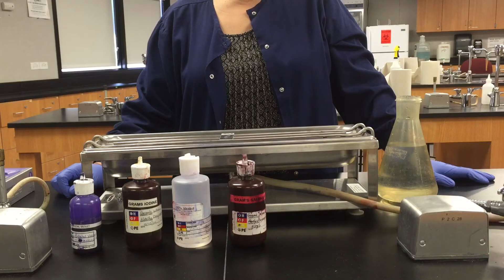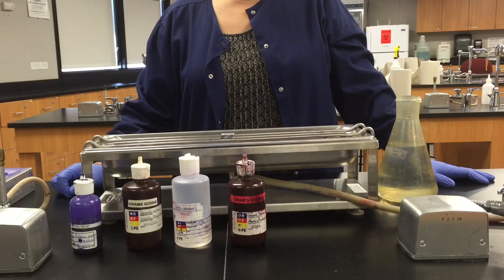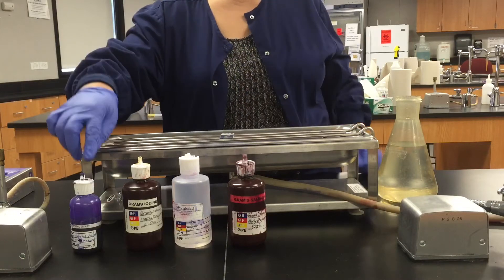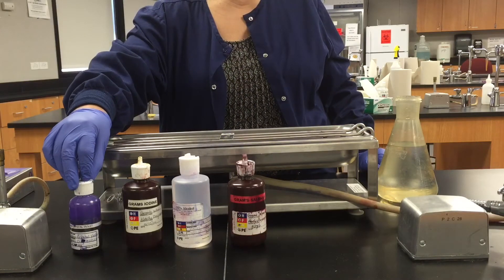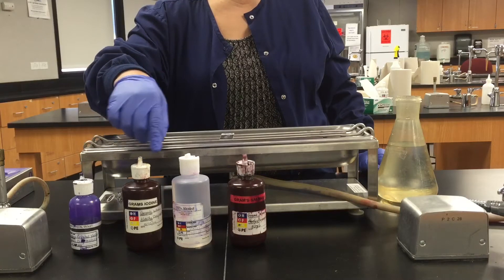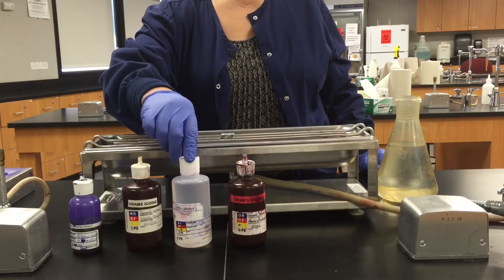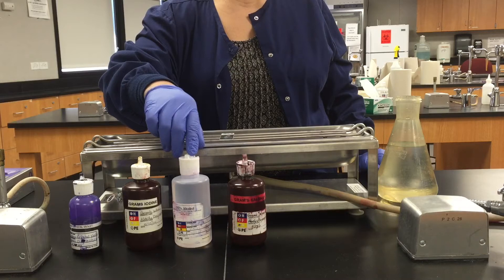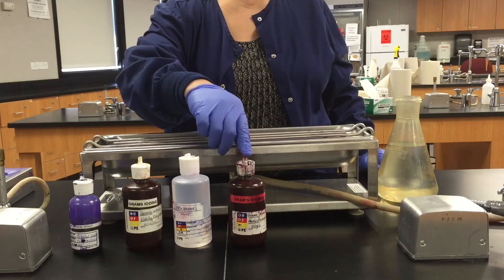Here are the stains and reagents that we use for gram staining. From left to right: first we use Gram's Crystal Violet, then we will be using Gram's Iodine, then 95% alcohol. Make sure you don't make the mistake of picking up the 70% alcohol that's always on your bench — you've got to use the 95% alcohol for decolorizing or it is not going to work. And then finally, Gram's Safranin is our counterstain.